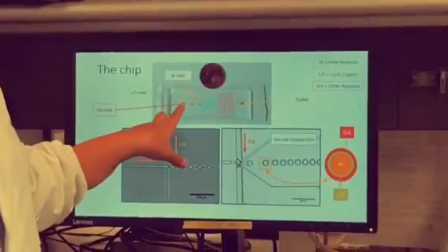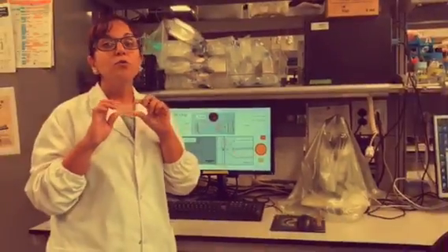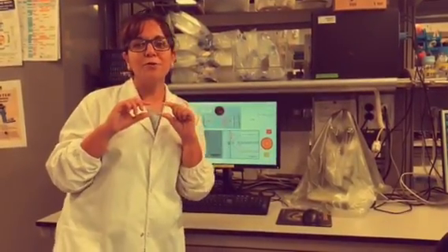Then, this chip has three inlets and one outlet, and to show you how it works, we are going to the microscope.